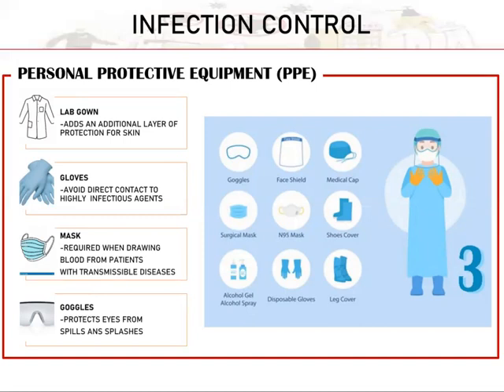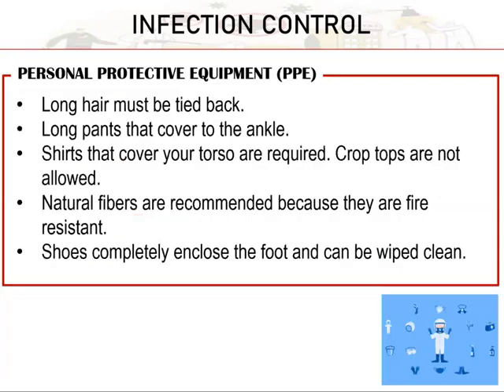This is usually worn, class, in the histopathology section in the laboratory. It's because in that section, we have a lot of chemical preparations, just like dilutions of formalin and preparations of our alcohol. These are highly irritant, and if they splash into the eyes, it can lead to blindness. So we must wear goggles when we prepare the chemicals.